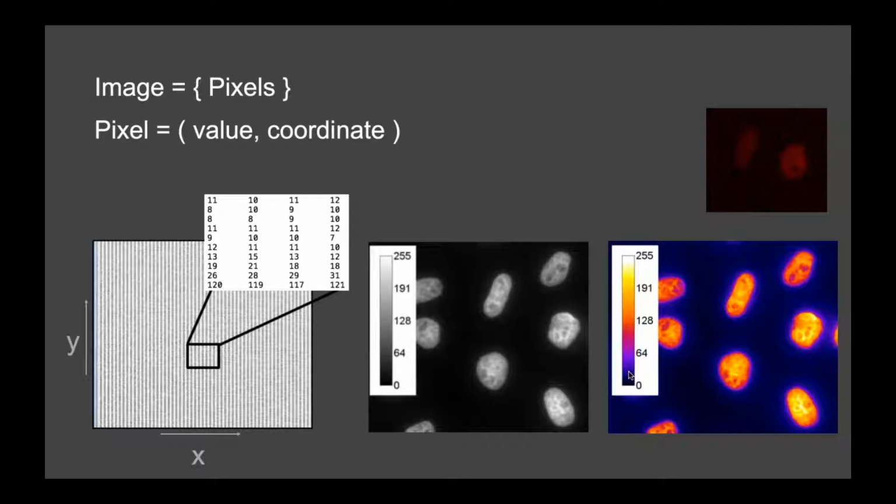Something that's not recommended is what comes up now, and this is basically using red lookup table on black, because I personally, for example, don't have a red weakness, and I think 15% of our viewers now see nothing on this upper image, and that's still a common mistake. So if you give a talk, for example, with this image, you will lose a good fraction of your audience because they just see a black image. So basically the red lookup tables are maybe the ones that you should avoid if possible.